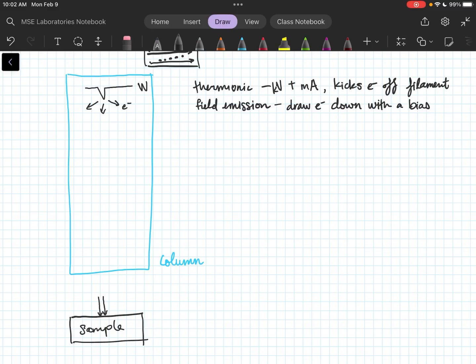There are some systems which allow not as strong a vacuum around the sample, so your sample doesn't have to be fully evacuated. But either way, the column for sure. We need to pull air out of it. That allows our electrons to travel in that nice straight line once we create it, without bumping into air molecules that are going to scatter them around or maybe even absorb those electrons.